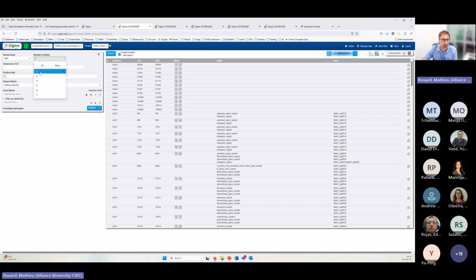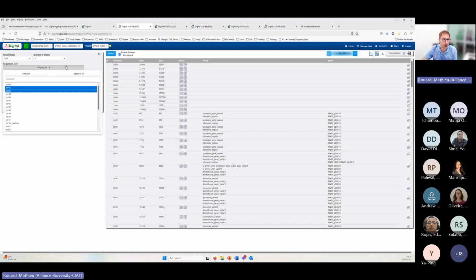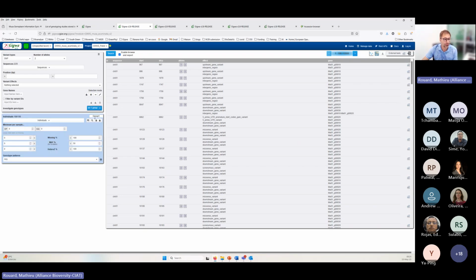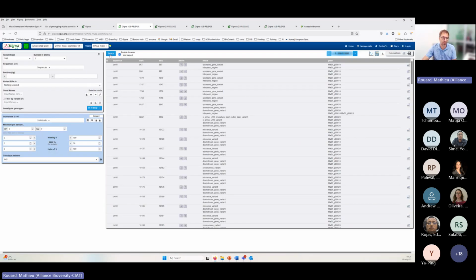Then you want only the biallelic markers, and you filter again. You may want to take only 2 chromosomes, you filter. You see, it's quite fast to reply. You can work with groups, so you can work with your different individuals and select different individuals. In that case, you're going to select only the markers for this type of individual.